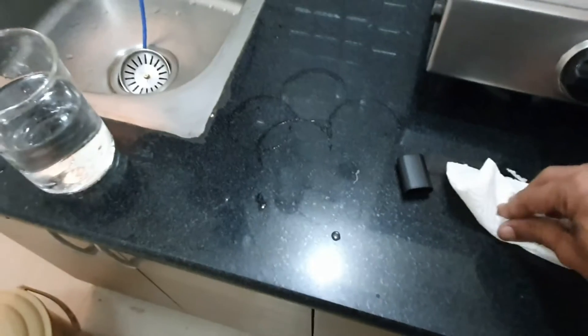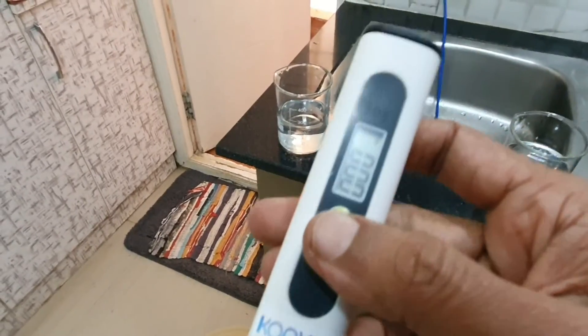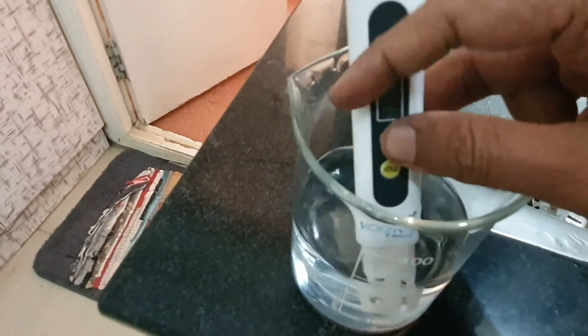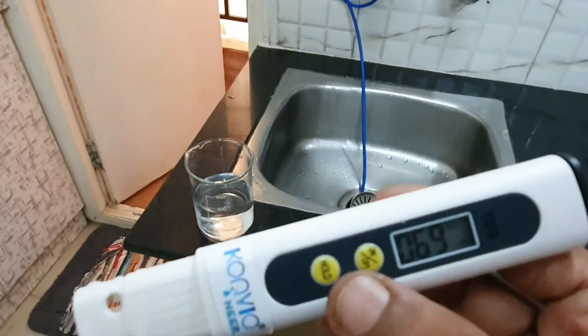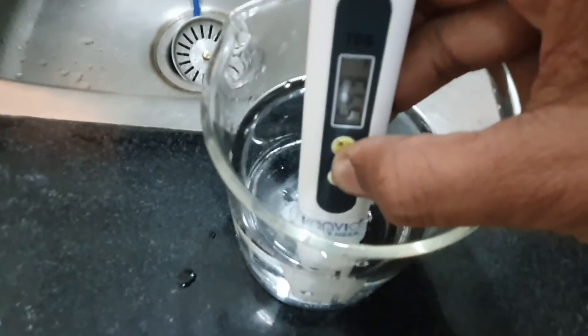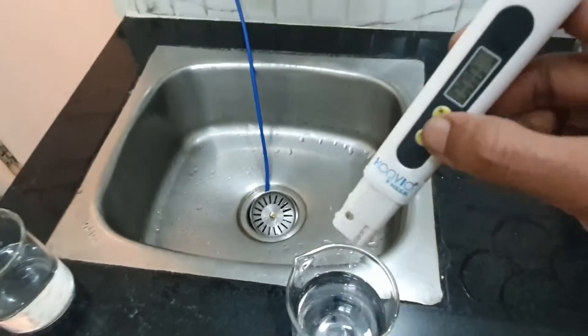Now I'll gently clean the meter off with the tissue. I'll switch it off and switch it back on — it's back to zero. Putting it into the filtered water now. I have a reading of around 543 for the tap water confirmed earlier, and now for the filtered water — releasing the hold, putting it in — the reading is coming up.